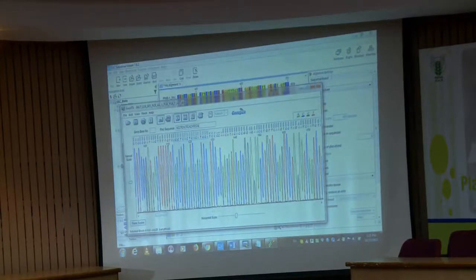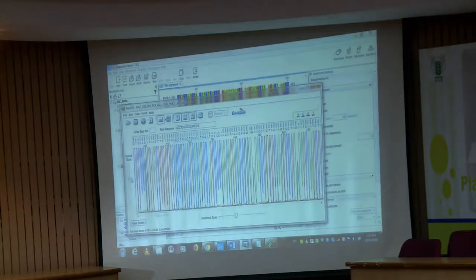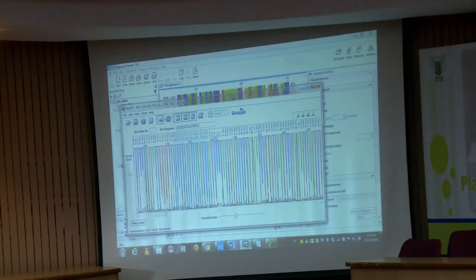Just go down and see, whenever multiple nucleotides are present in the sequence, the resolution of those peaks decreases. So the machine cannot read properly what base it is. The quality of that particular base is quenched down if the resolution is not proper.